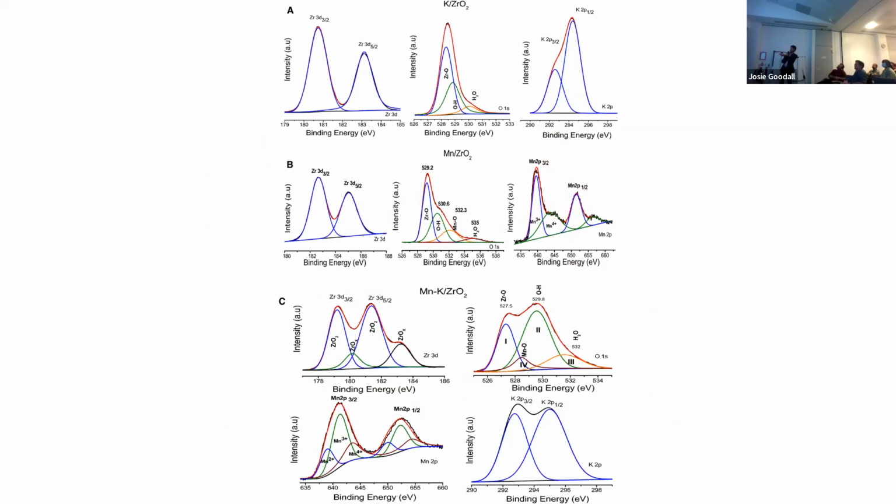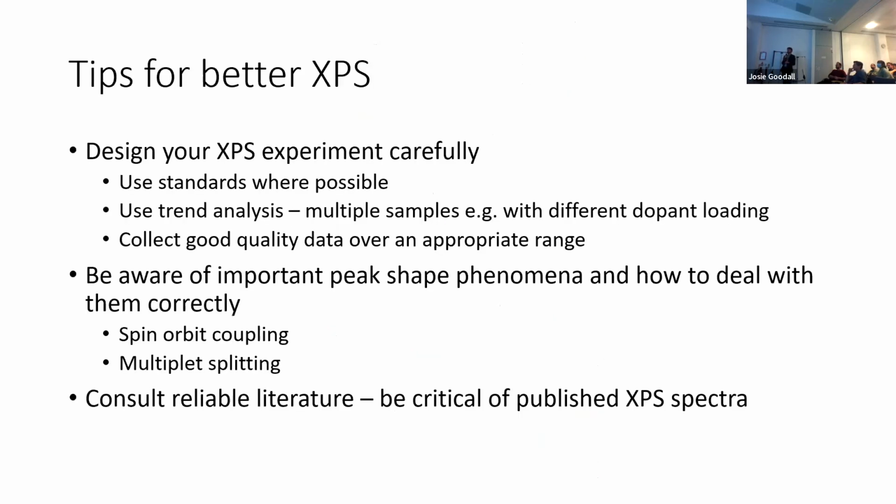Again, down here as well, so 2 plus. And now we have the potassium 2p 3/2, 2p 1/2. Different widths and completely wrong intensity ratio, and still, oh no, they're the right way around. Everything else is wrong. So that was it.